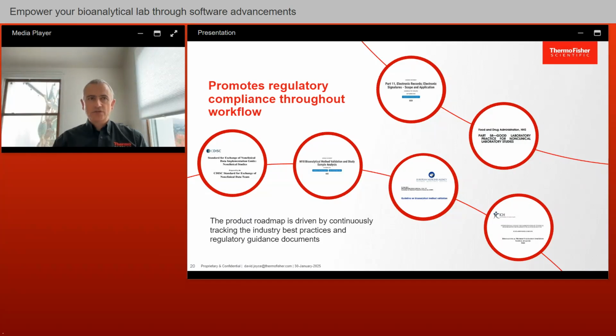We add new versions of that software on a regular basis to try and address these needs of the regulatory bodies. That way, everybody is doing it consistently, and it's not something that you need to keep on top of. Obviously, you need to know about these things, but it's not something that you then need to codify into your software or into your practices in order to keep within the bounds of regulation.